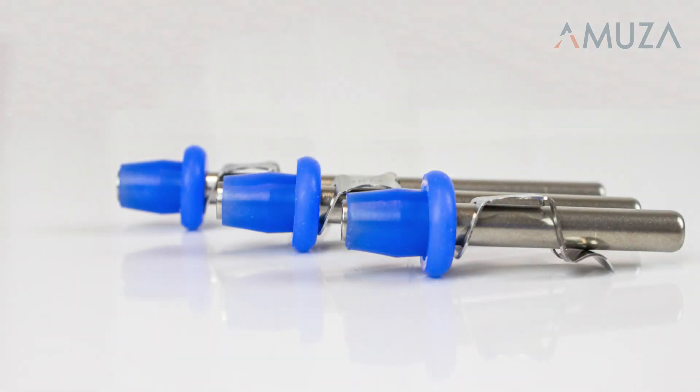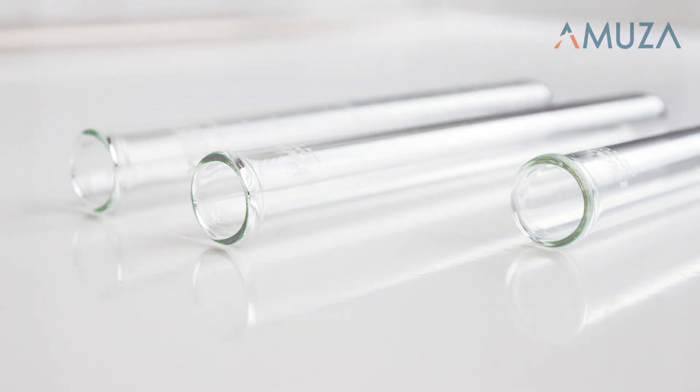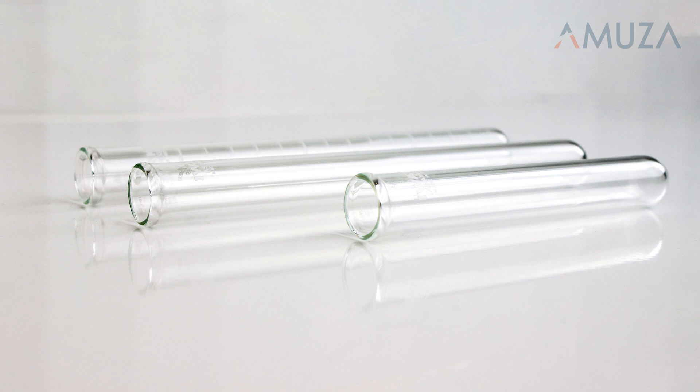The DrincoMeasure is one of our most simple products, but an extremely useful one for gathering precise measurements of liquid consumption in animal studies.